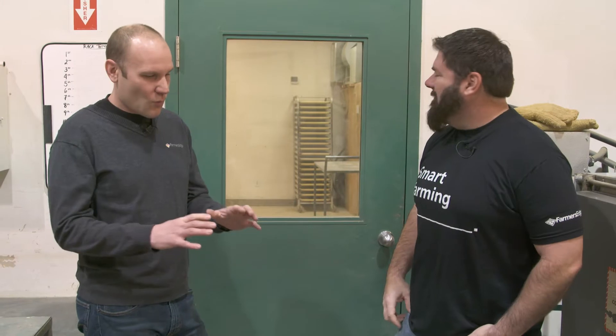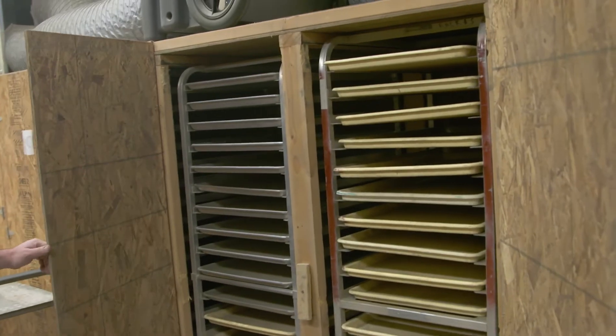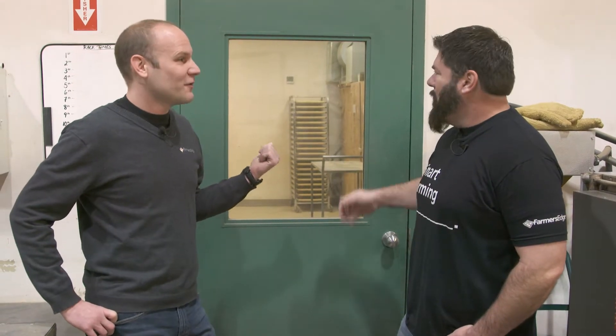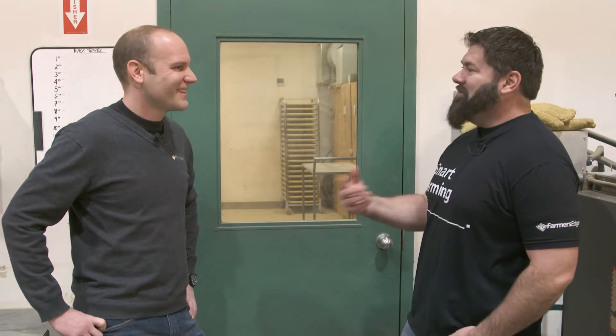This is our sample receiving area — kind of the whole birth of the process. By this time, the samples have been taken from the field. The next step is to unpack them, inventory them, get them logged into the system, and then they go right off into our drying room. Once you've got that sample unpacked, it goes into a little tin tray on a big baker's proofing rack — we like to borrow good solutions from other industries. It rolls into our drying tunnels where we bring in warm, dehumidified air and it dries right out. It's 40°C — 105°F — in there.